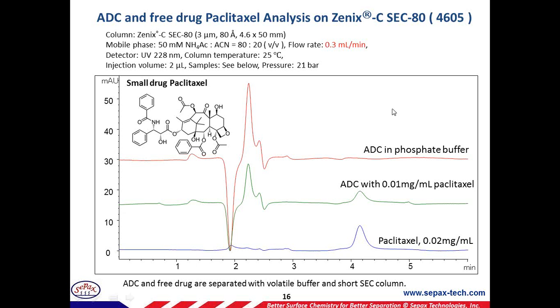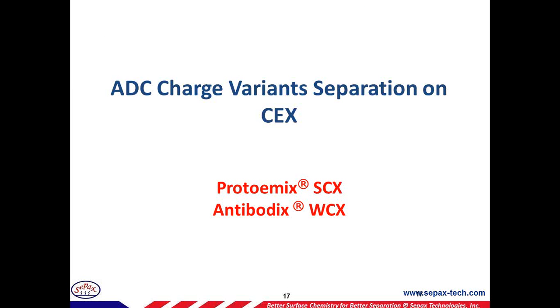Especially for lysine conjugates, lysine carries a positive charge. So for each lysine conjugate, you will decrease 1 positive charge. IEX may reflect more of the drug loading information rather than providing information on the mAb protein molecule. However, I haven't seen a lot of publications on using the CEX cation exchange for the ADC charge variance study. However, we do see a lot of customers using the CEX for their current charge variance study, and some of the profiles being really nice, successfully monitoring the charge variance of the ADC samples.